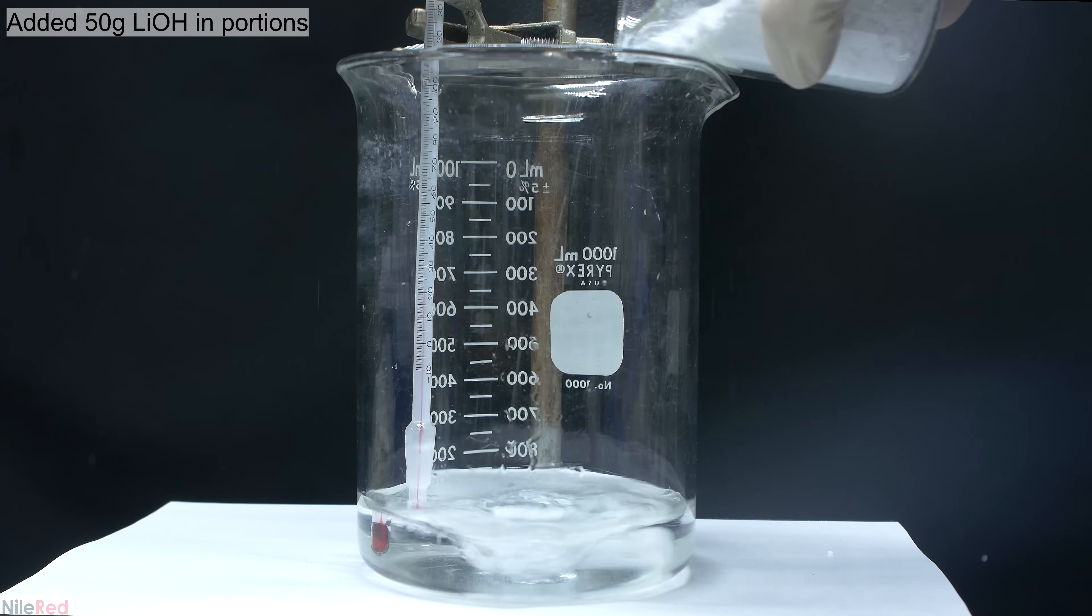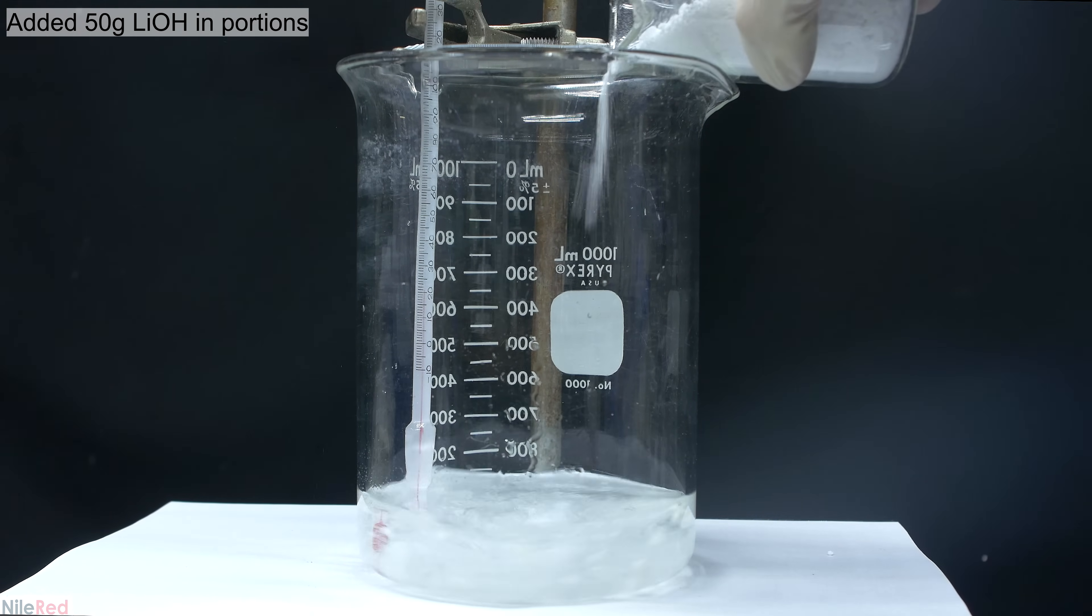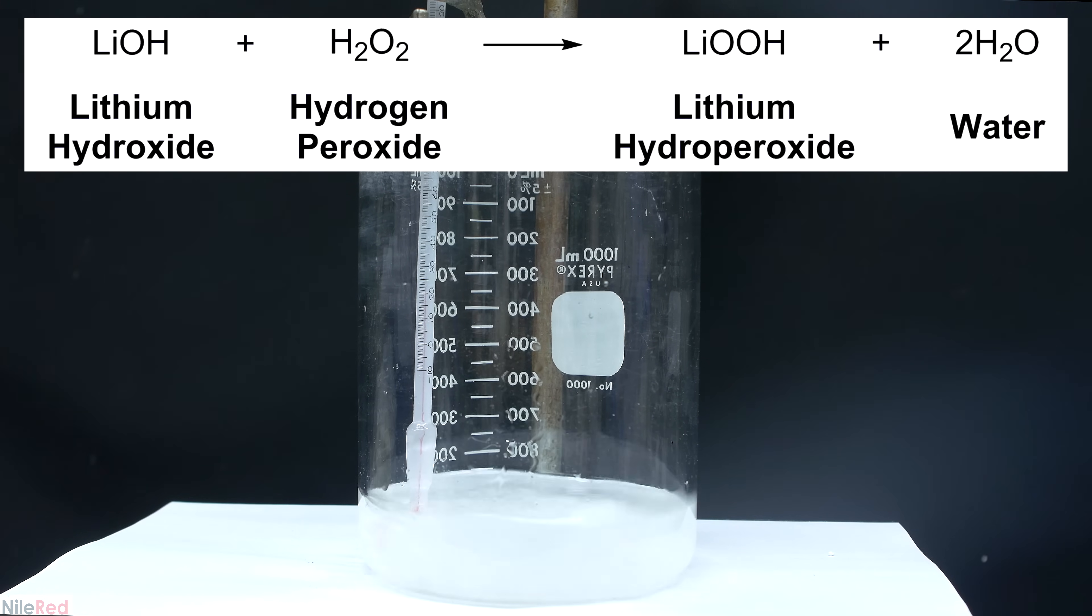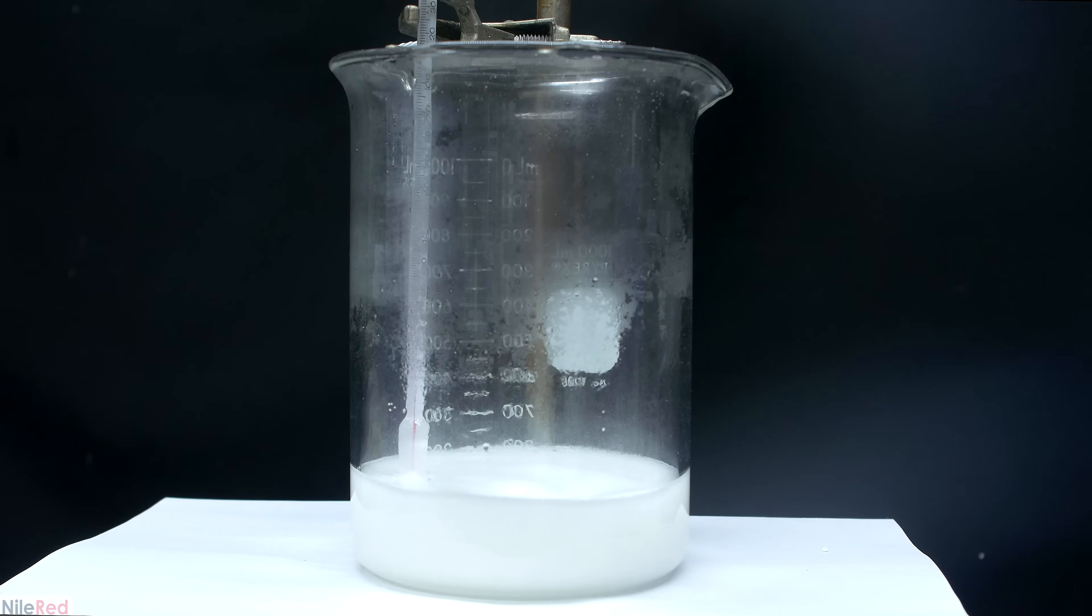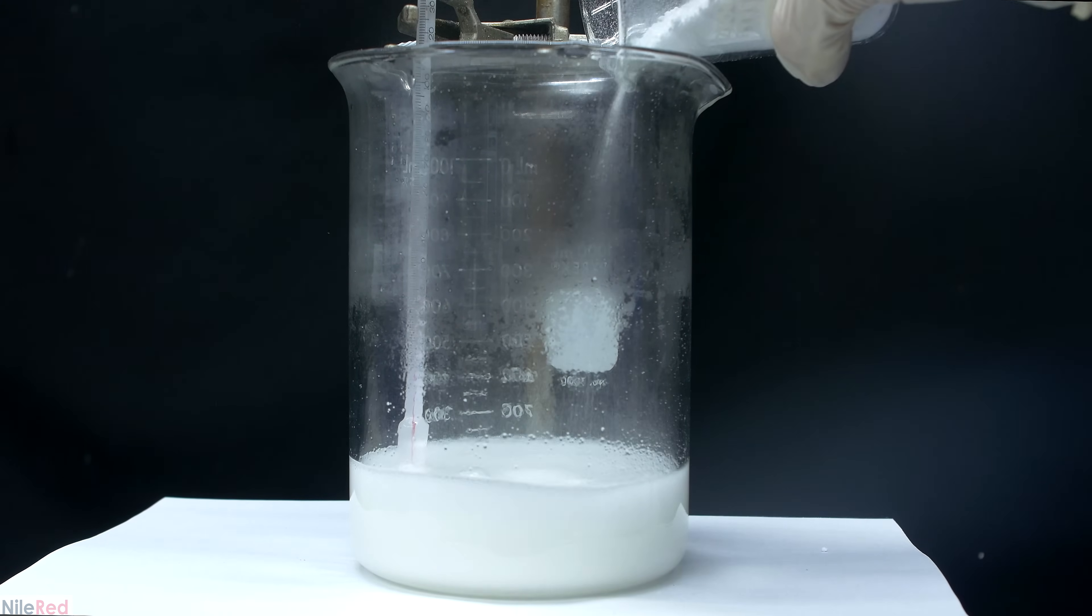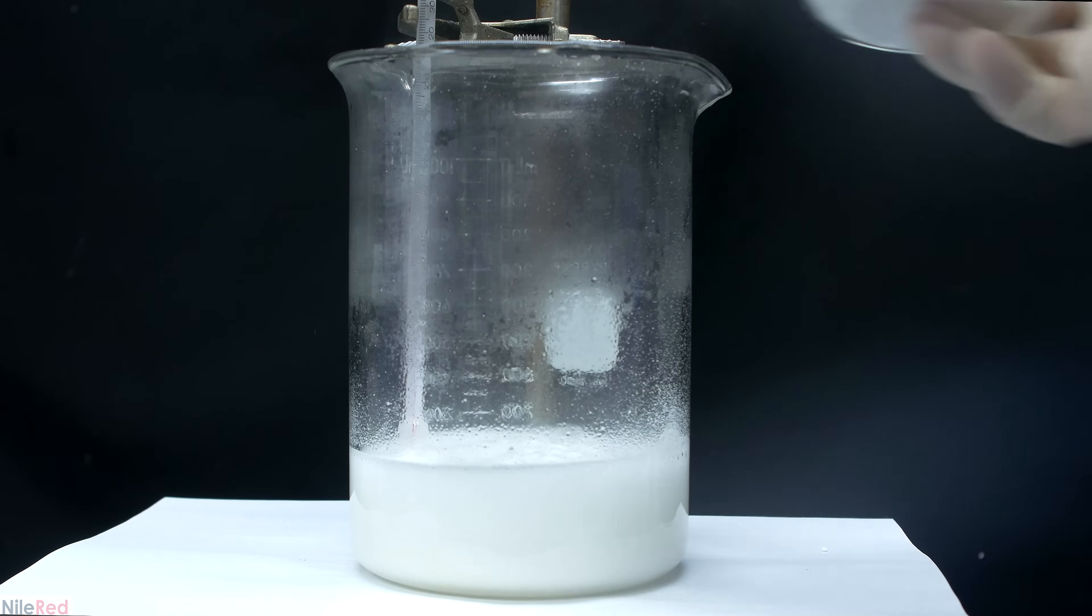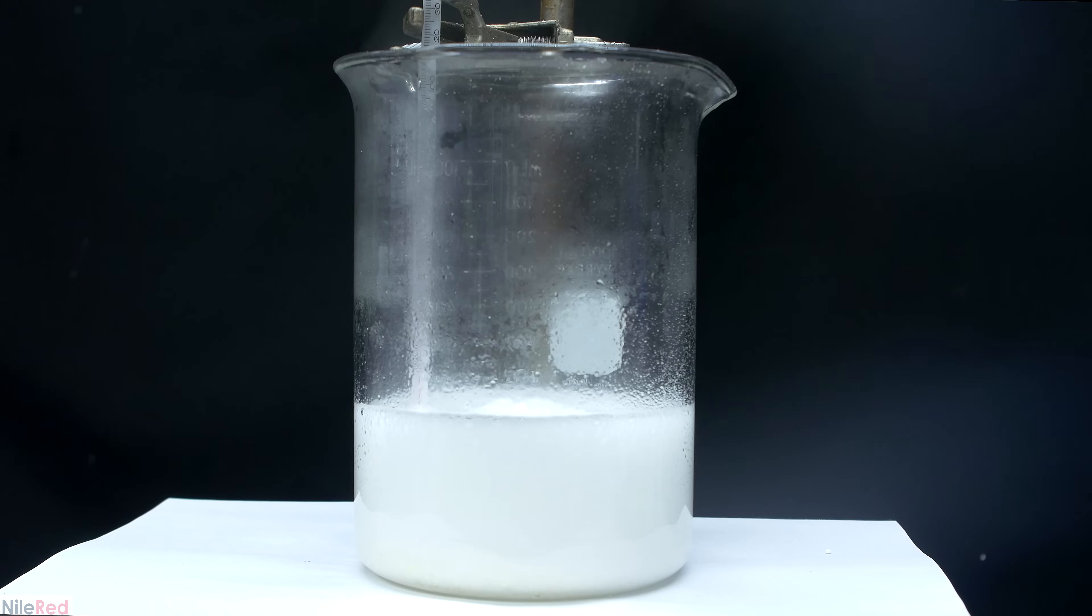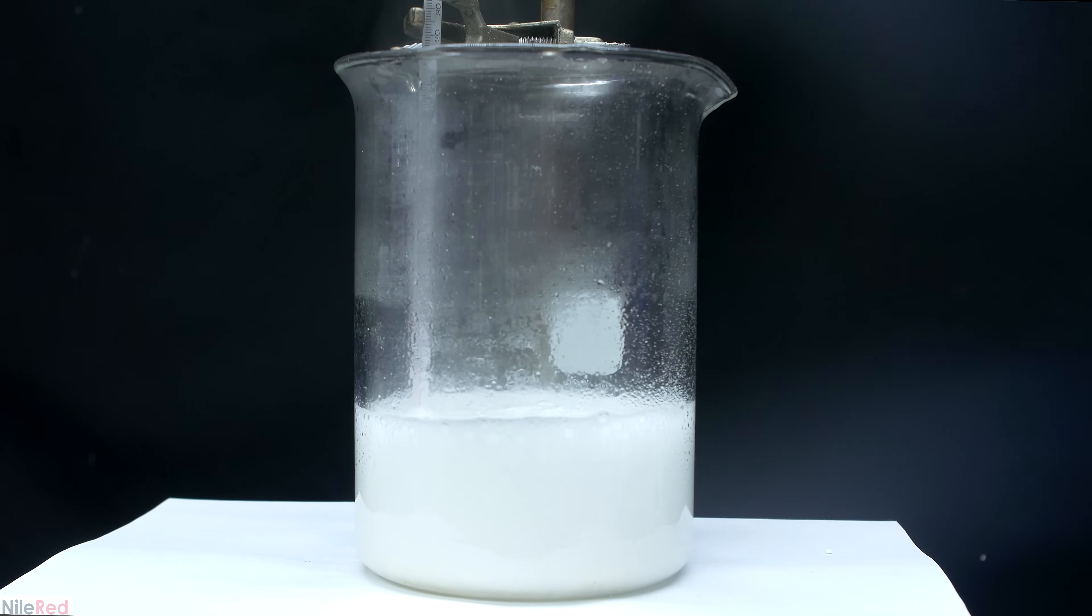Immediately after adding it, it will start to react and produce lithium hydroperoxide. Things will slowly heat up as we continue to add the lithium hydroxide and some of our hydrogen peroxide will start to break down. Hydrogen peroxide is quite sensitive and it pretty easily breaks down into water and oxygen gas. So, the bubbling that you see here is actually the release of oxygen gas and the solution isn't boiling.